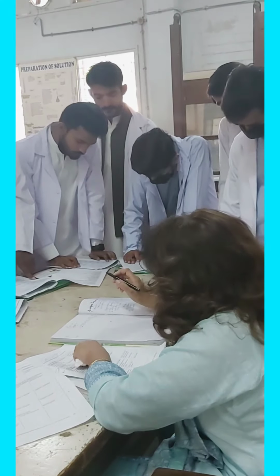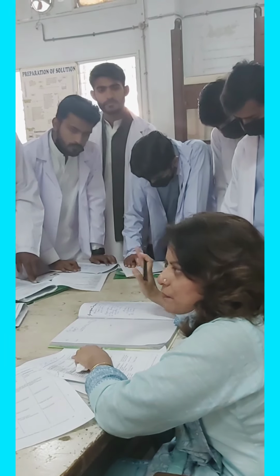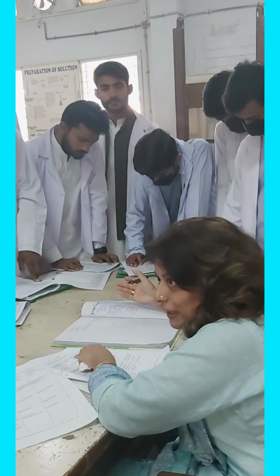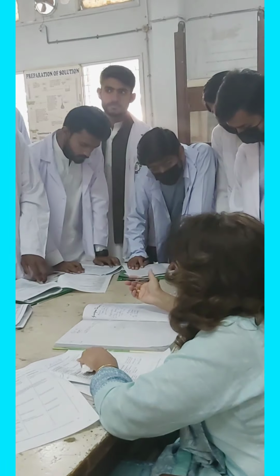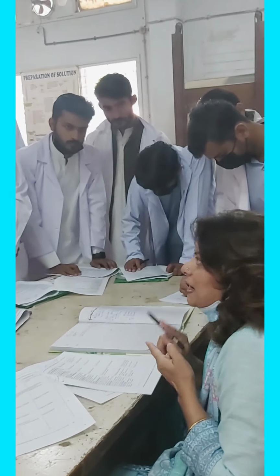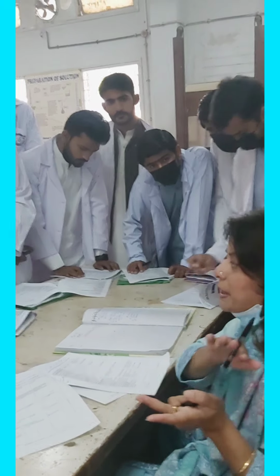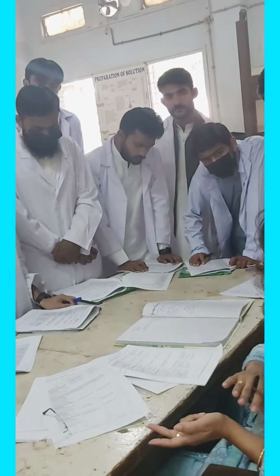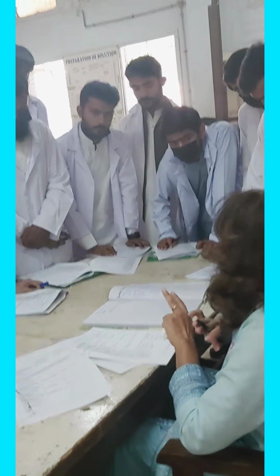Now, the options they have given us: carboxylic acids. If you find effervescence, then what is your compound? It could be a carboxylic acid, or a sulfonic acid. But they have given the indication when nitrogen and sulfur were present in the previous test. Then you can also call it a sulfonic acid, but otherwise no. But in our case, again.